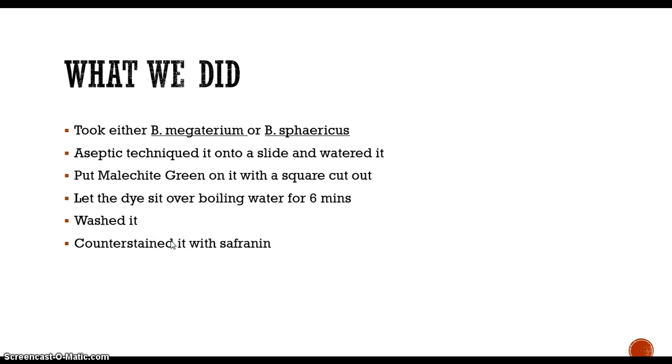The purpose of the endospore is to protect the bacteria from anything that happens while it can't grow and germinate. Obviously, endospores are very, very tough, from what you've learned in class already. They go into this endospore state, and once the nutrients and the environment become good, they'll recognize it, and then they'll sporulate again back into a vegetative state.